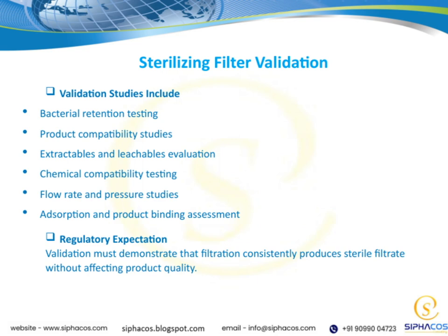Now, from a regulatory perspective, the main expectation is that validation must prove that the filtration process reliably produces a sterile filtrate, meaning no microorganisms are passing through, and that this process doesn't compromise the quality of the product. This is fundamental to ensuring patient safety and maintaining compliance, tying all these validation activities together within the broader scope of quality assurance.